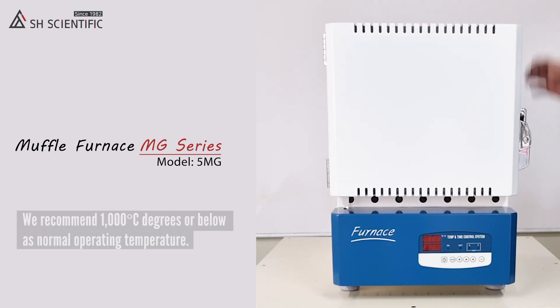Heads up! We recommend you run this at 1000 degrees or below as the normal operating temperature. It can reach up to 1100 or even 1200 degrees, but that is not ideal considering durability.